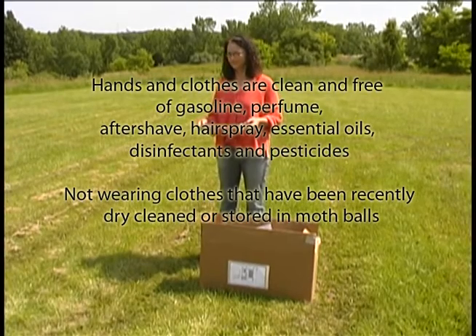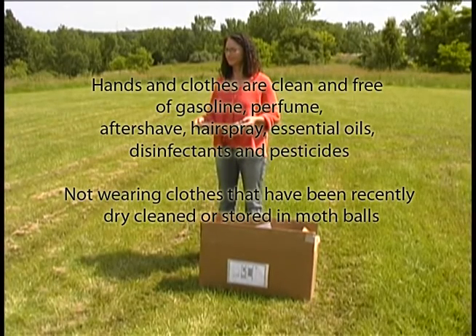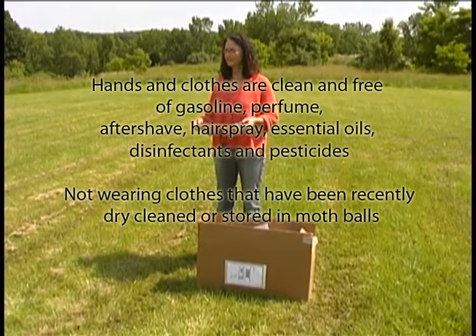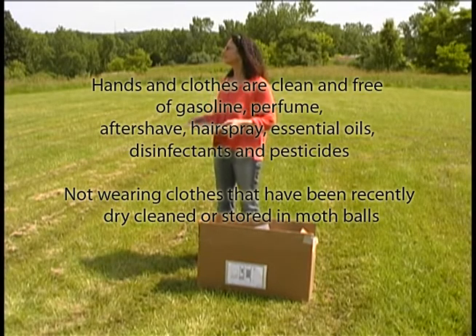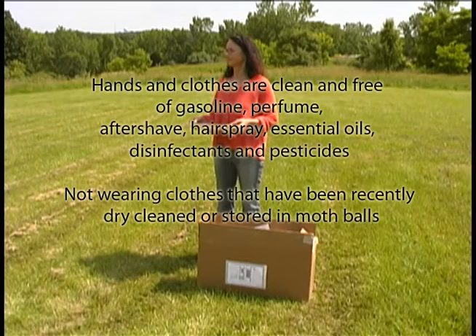Our hands and clothes are free and clean of gasoline, perfume, aftershave, hairspray, essential oils, disinfectants, and pesticides. We are not wearing clothes that have recently been dry cleaned or stored in mothballs.